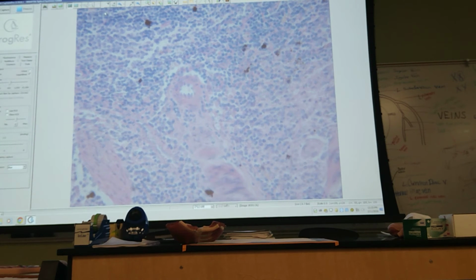There may be more than one. A couple semesters ago, when I was teaching this course, some student found 5 in one splenic nodule. That's a little high. Usually you might find 2. Or on occasion 3. But in that one case, we saw 5. Okay? You may even come across one where you don't see an obvious one. Right, but those are called central arteries.